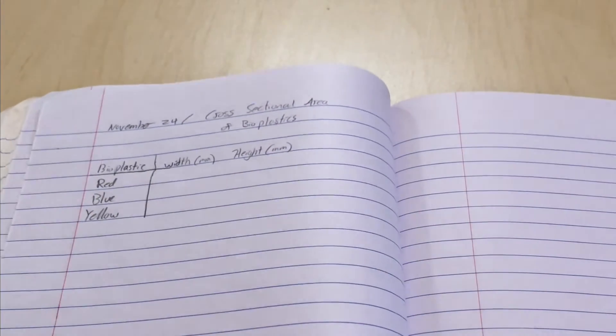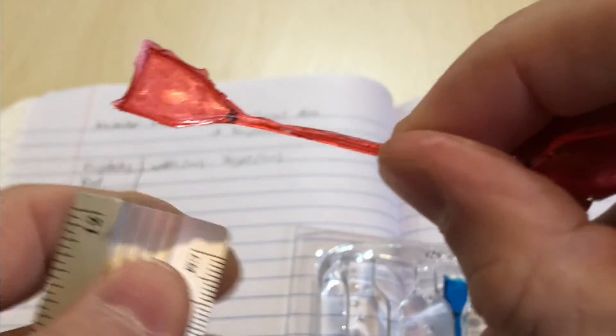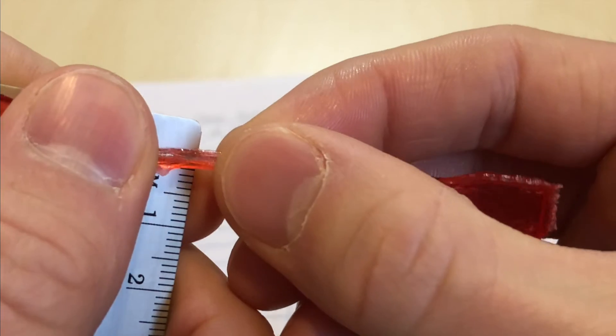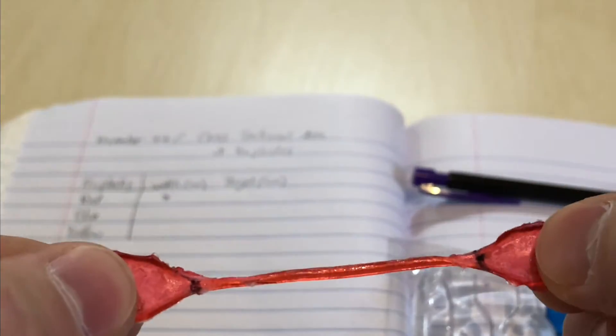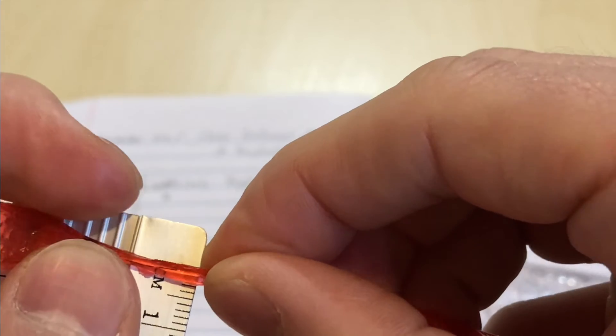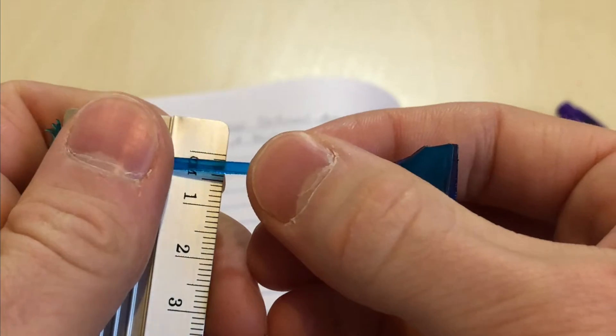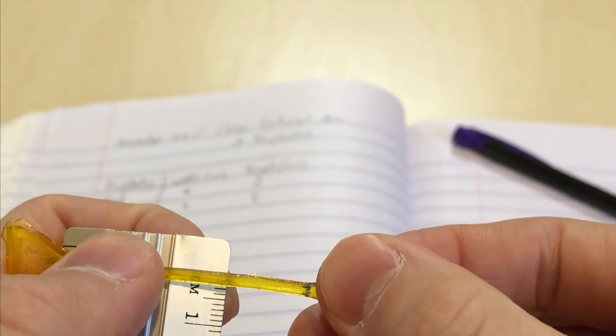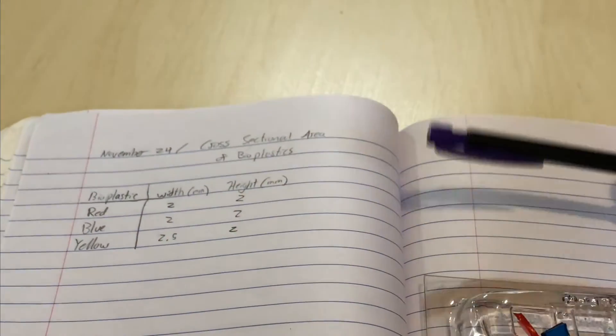Next, you will record in your notebook the width and height of the neck region of each bioplastic. Hold your dumbbell sideways so that you can see the wide part of the dumbbell. Then, hold it against the ruler along the millimeter mark and record the width in your notebook. Now, hold the plastic dumbbell flat and measure its height in the same way recording the value in your notebook. Measure the width and height of each of the three bioplastics and record it all in your notebook. The measurements of the width times the height will give us the cross-sectional area which will be used in our stress formula in video 2.